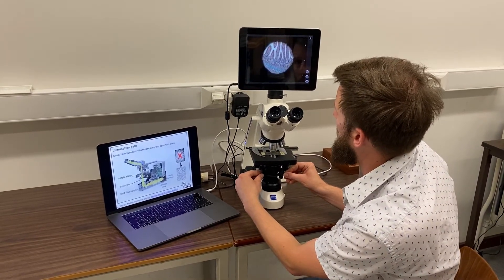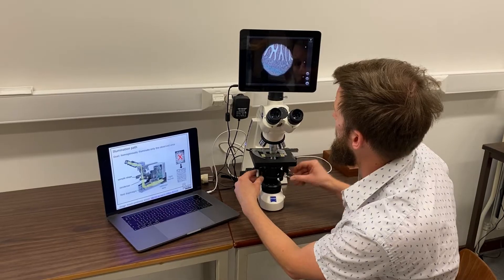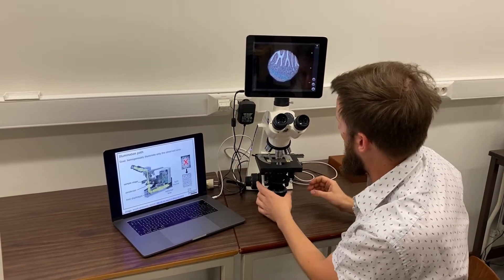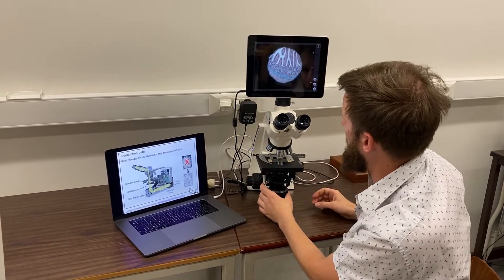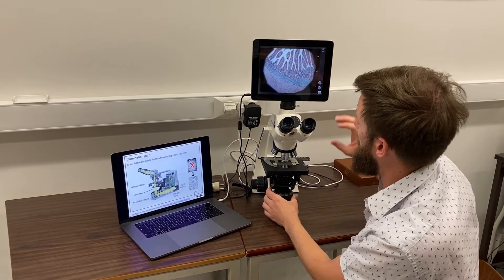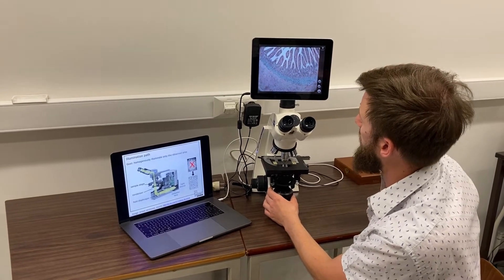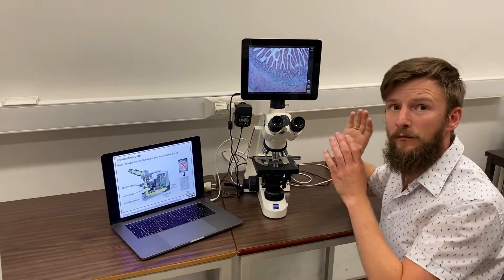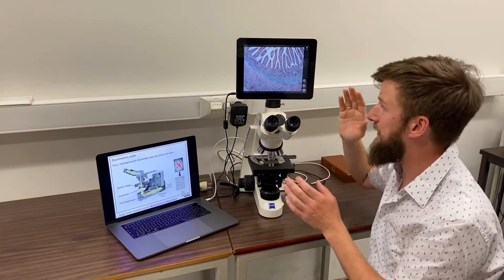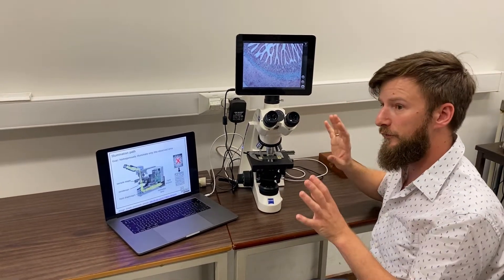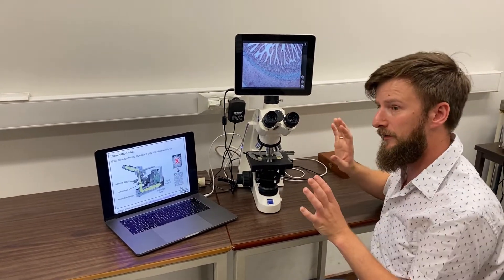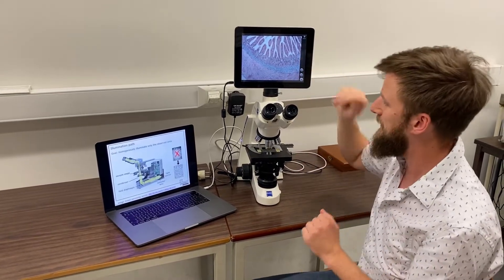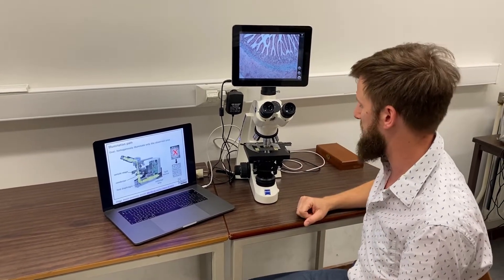Usually we center the field diaphragm in the field of view — this is our field of view here — and then we open the field diaphragm to just beyond what we observe. This way we don't illuminate more than we actually observe, so we preserve the sample and also have the lowest possible background in the image that we actually observe.